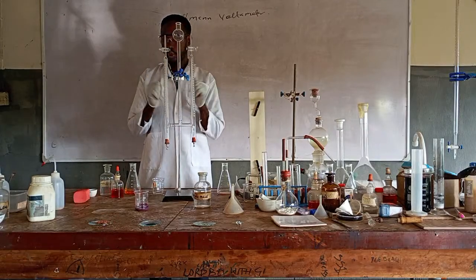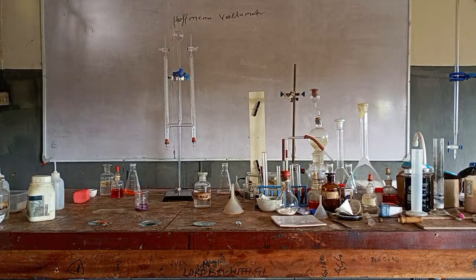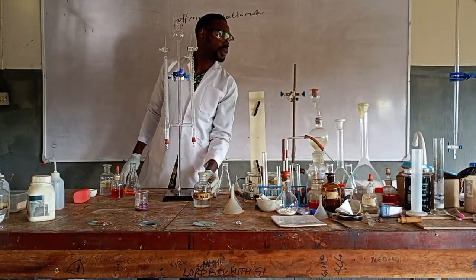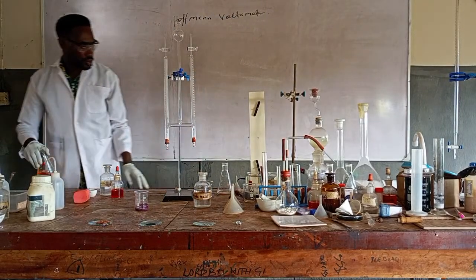That's the meaning. So I'll use water to do that. Okay, let me use this one.